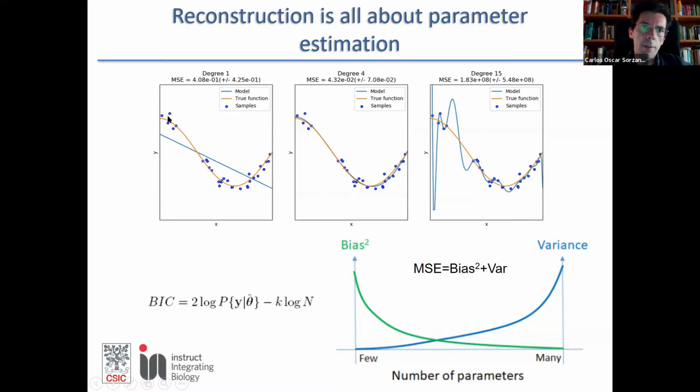In our case, the blue points are the images and the model is the structure. You might have a very simple model, this blue line here, that tries to represent the true underlying model. If your model has very few parameters, then probably what you have is a bias.